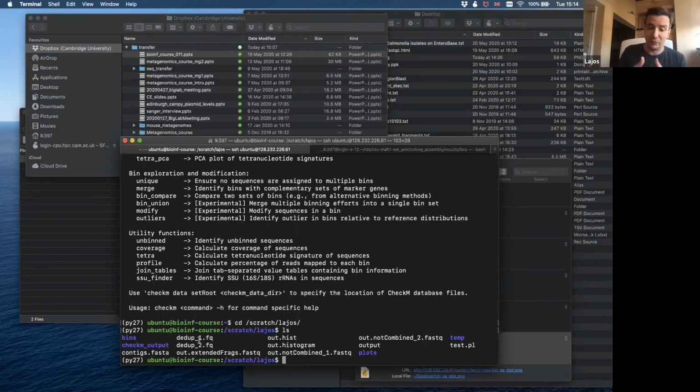So instead of doing it for multiple files, we will just do it for one file, but even that one file has to be in a folder. So if you don't have this bins folder, what I have, just please do it. So make mkdir bins. Of course, I don't do it because I have it. And just simply, if you have the bins directory, just copy your contig-FASTA to your bins directory like this.